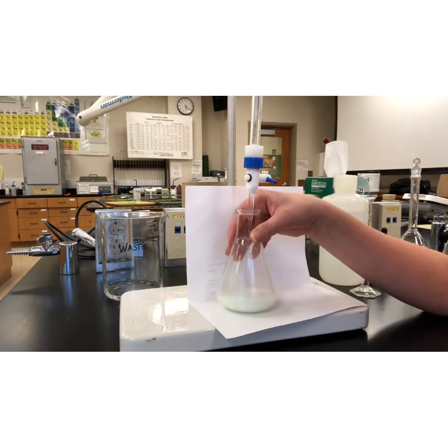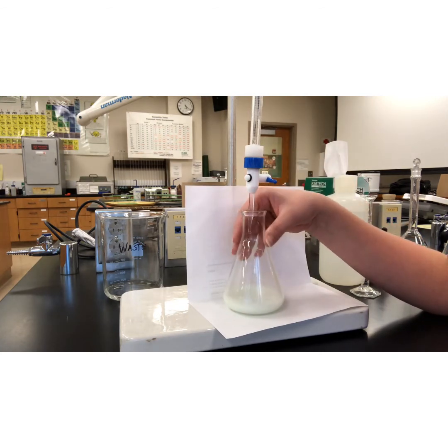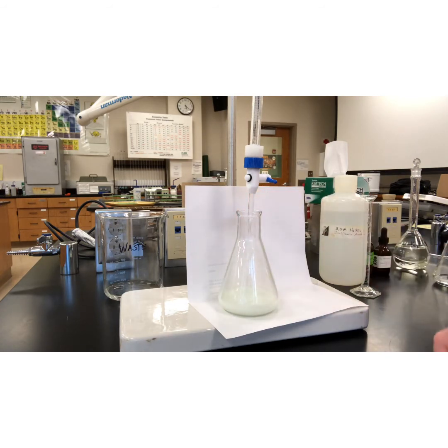All right, I definitely see a blue tinge across this entire solution. So what I'm going to do is go ahead and note my current volume, and then add a little bit more. And if it's a stark color change after that, that means that I was at my end point. So we can note it and not overshoot it.